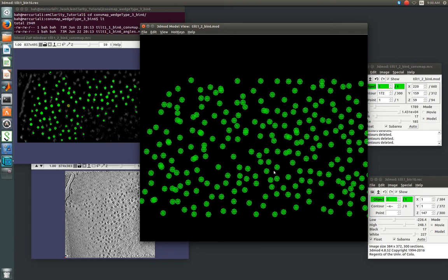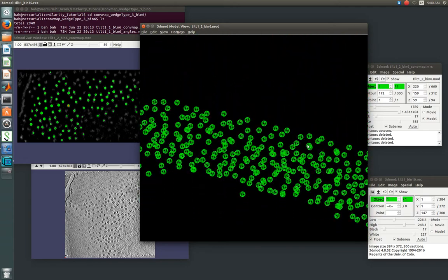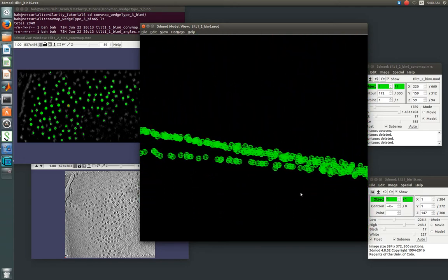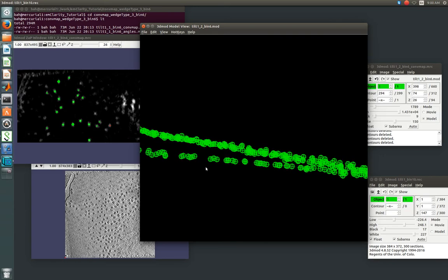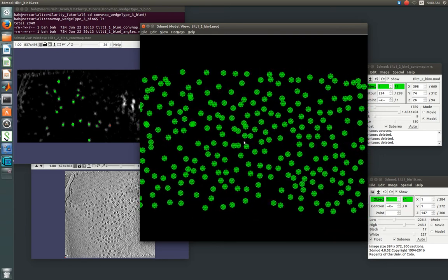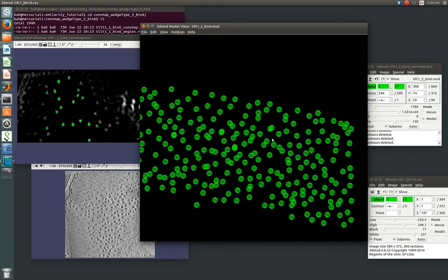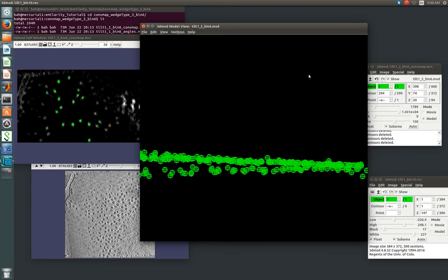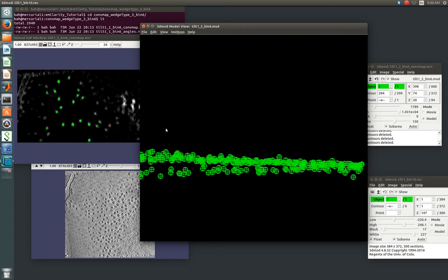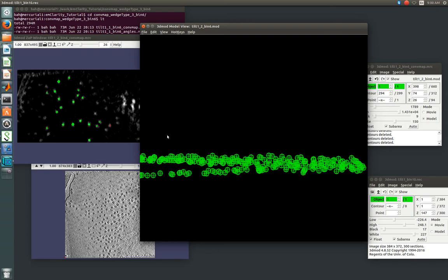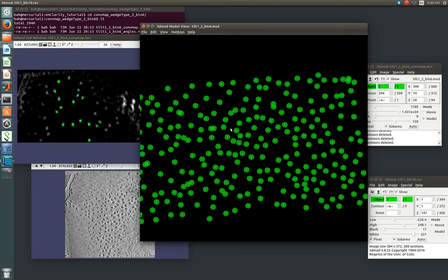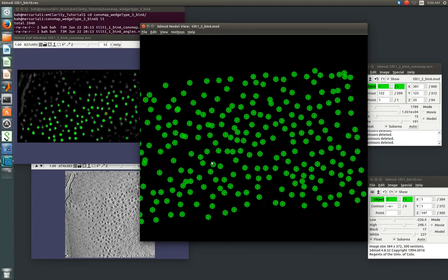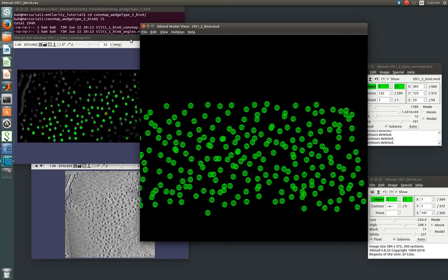Now, leaving a few false positives is fine. We can get rid of those later when we deal with classification. But, as with anything else, if you put junk in, you're going to get junk out. So, you do want to take the time, and this can get a little bit tedious if you have 100 tomograms, but it's going to save you a lot of time. Where you may invest 2 to 4 hours on 100 tomograms of your own time. That's going to save you a ton of computational time later.